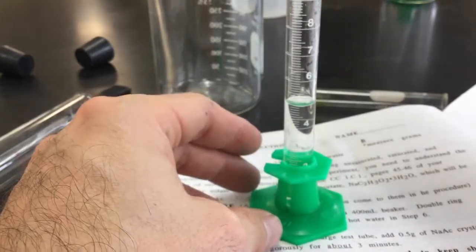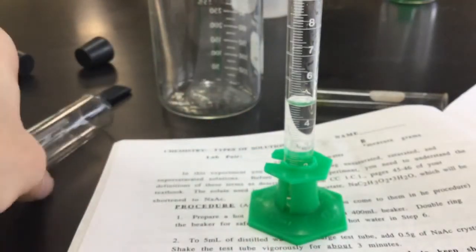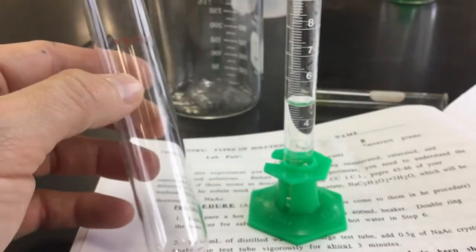If you overshoot a little bit, use this plastic pipette — reach in there and get a little bit out. Get yourself exactly at 5. Once you do that, you've got this gigantic test tube that you're going to use to put that solvent in.